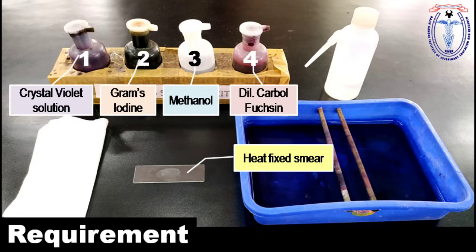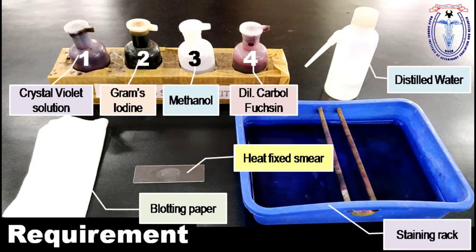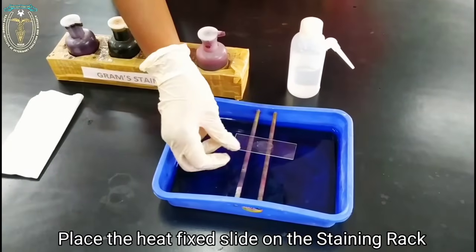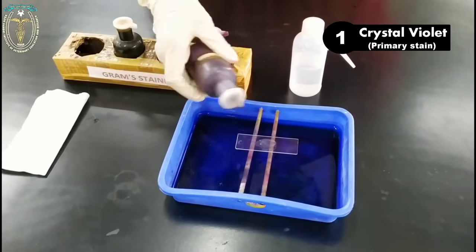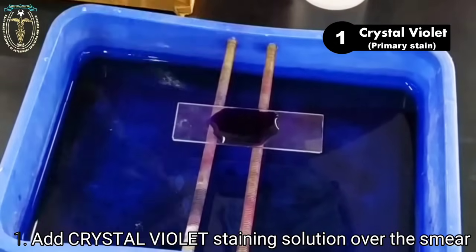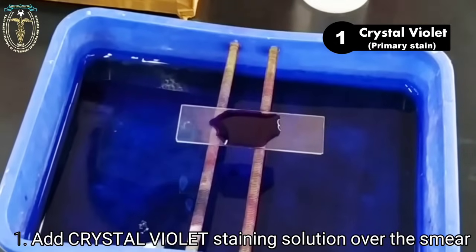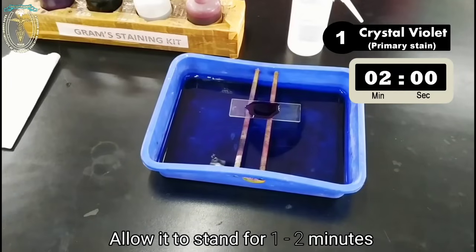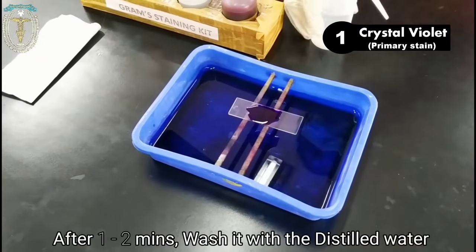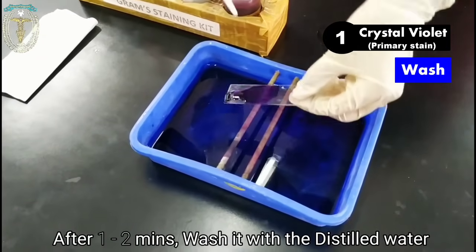Apart from this, the other requirements are the distilled water, the blotting paper, and the staining rack. These are the requirements for conducting the Gram staining procedure. After the preparation of the smear, place the fixed smear on the staining rack. First, add the crystal violet staining solution over the smear. Cover the entire smear with the staining solution and allow it to stand for 1 to 2 minutes. After 1 to 2 minutes, wash it with the distilled water.